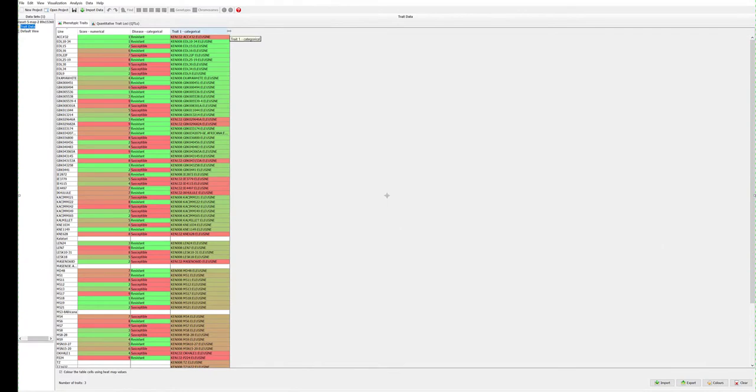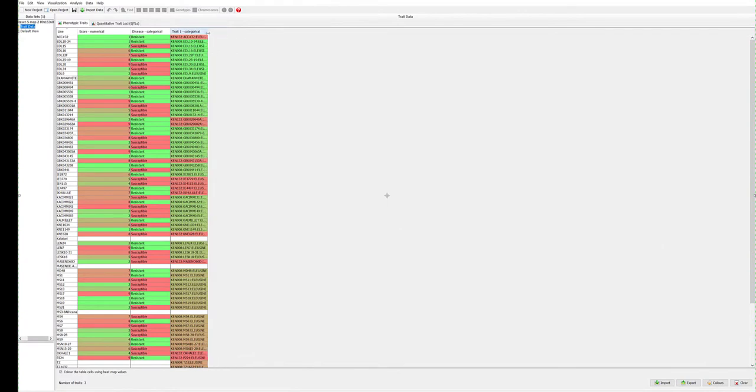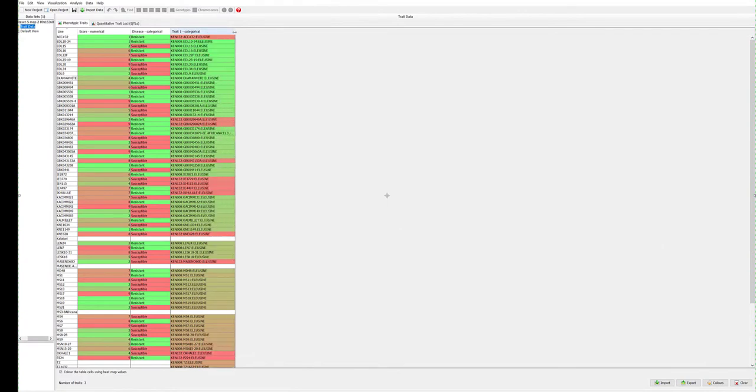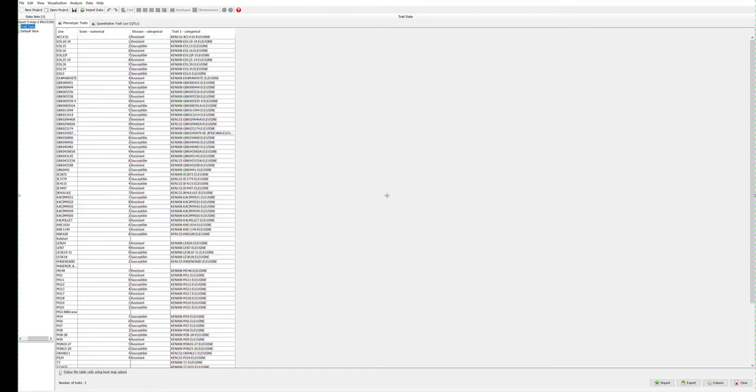A helpful summary window will appear. Phenotype information can be viewed from this table and Flapjack uses a heat map display which can be switched off if desired.